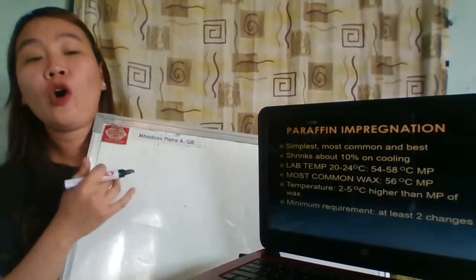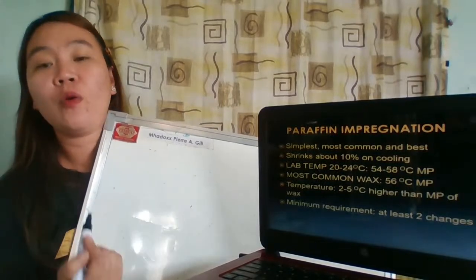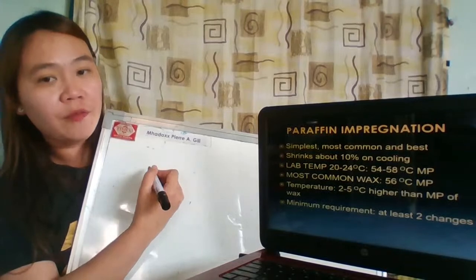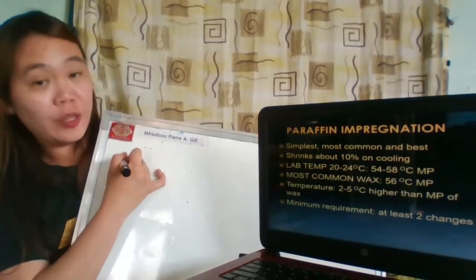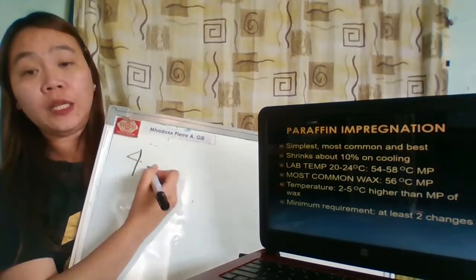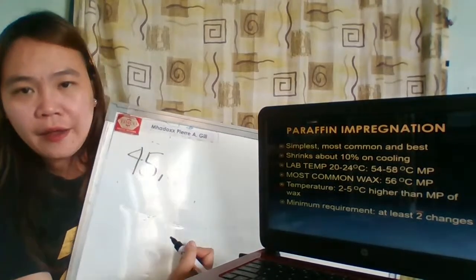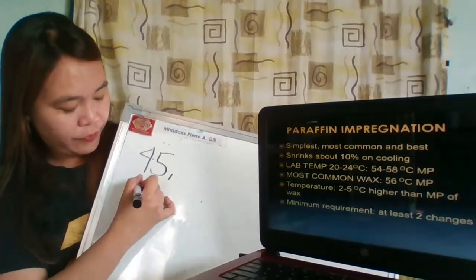Alright. So common waxes that are used in the laboratory would have a melting point of 45. Okay, 45. And then 52.